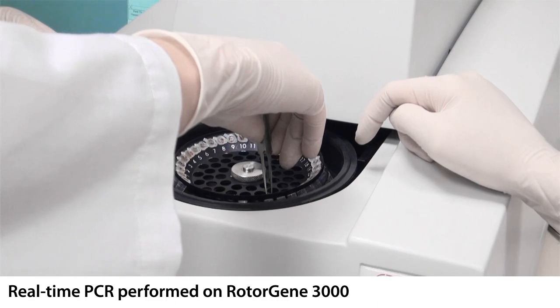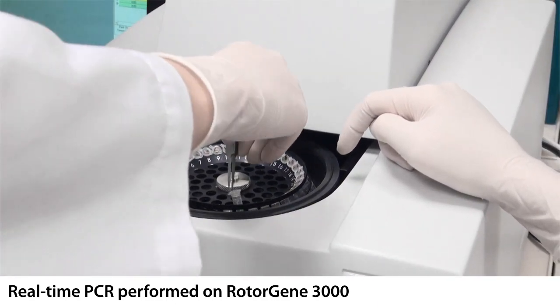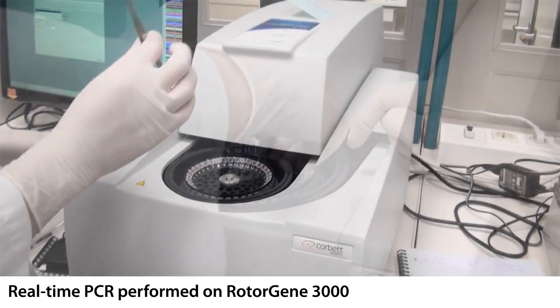Reagents for real-time PCR were provided by Center Research Institute of Epidemiology from Moscow, Russia.